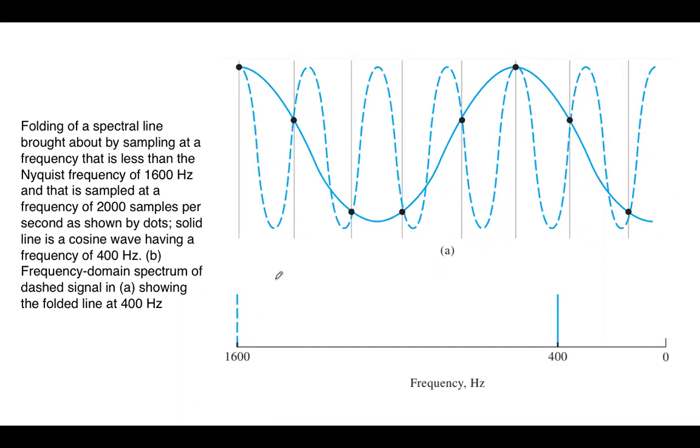And then this is the frequency domain spectrum, which is representative of this folded line here, which has a continuous wavelength. So it represents just one signal. We're sampling it at different points because the solid line is the representation of the radio frequency that is being given out by our radio frequency generator inside of our NMR spectrometer.